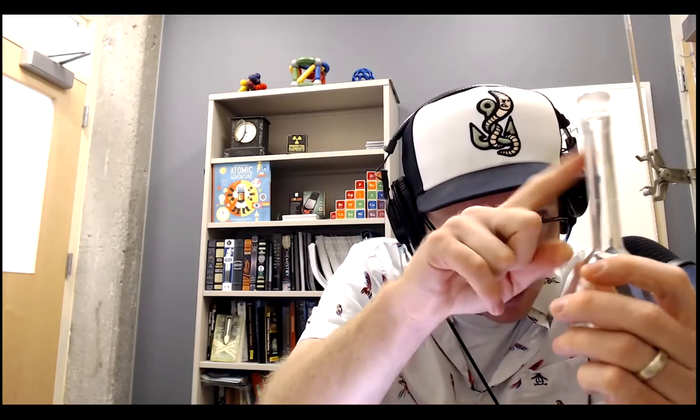Then you want to add water so the meniscus is right on the line. You want to get your eye level. You don't want to tell a meniscus from down here or up here. Got to be eye level, adding drops, get the meniscus right on the line. Once it's on that line, it's now really important to be really, really well mixed.